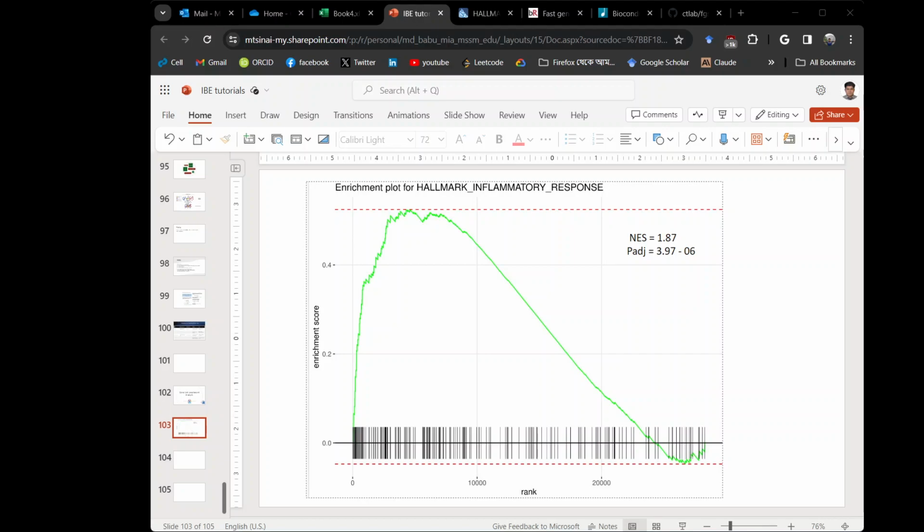When you look at this running green line, it indicates one thing: within this specific pathway, if the relevant genes of your list of differentially expressed genes, these inflammatory response genes, are present and higher in overrepresentation, or simply that they are overrepresented within your differentially expressed cell population, then this entire area of inflammatory genes will be upregulated on this area.